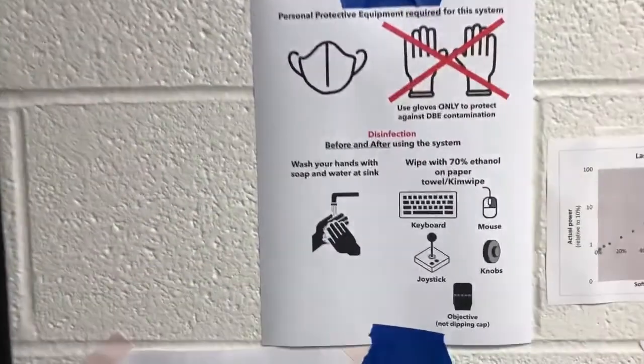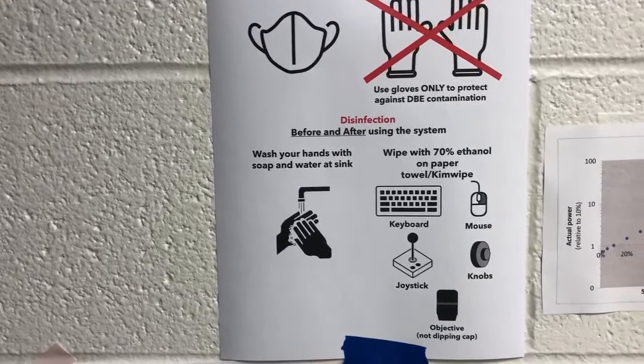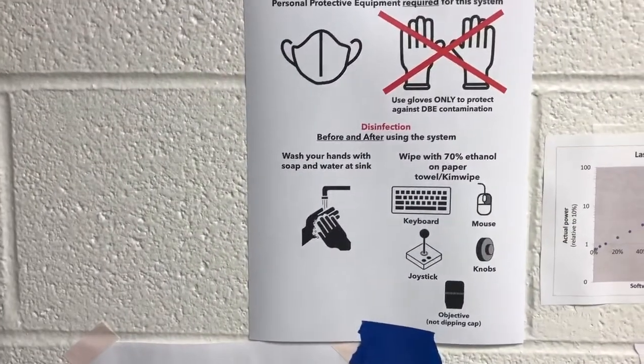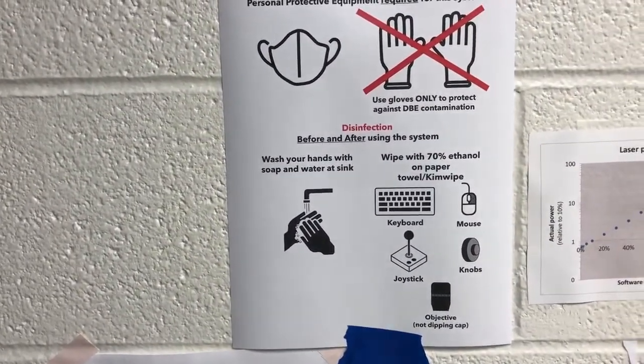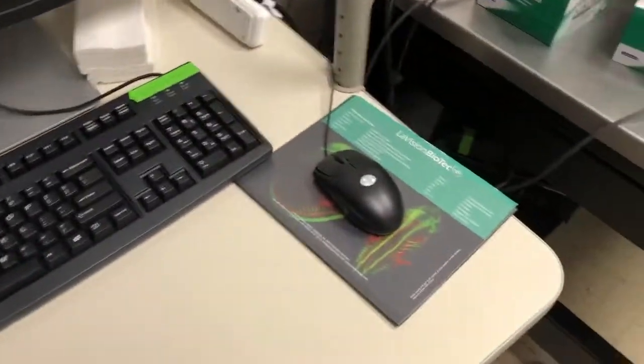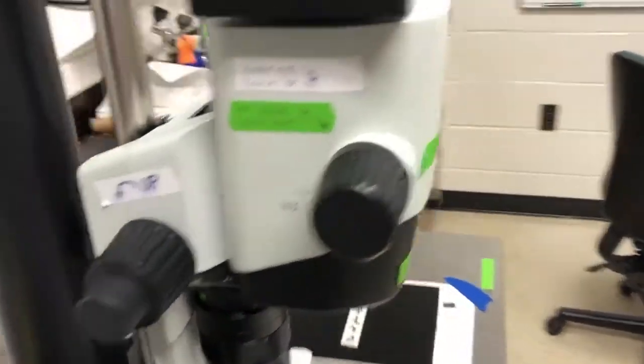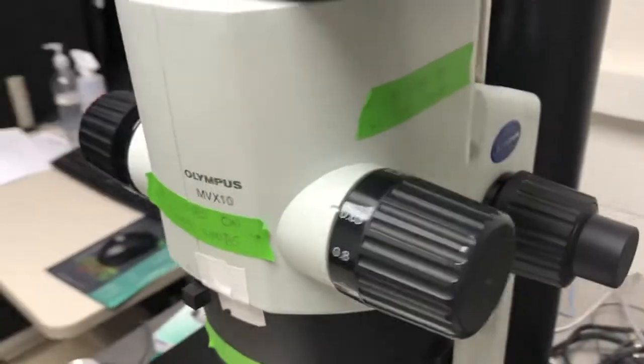So what do we need to do as far as disinfection? Before and after using the system, we're going to wash our hands with soap and water at the sink — there's a sink right there — and we're going to wipe with 70% ethanol and either paper towels or Kim wipes: the keyboard, the mouse, the joystick, and the knobs on the microscope. This is the focus knob, that's the zoom knob, on the other side as well.